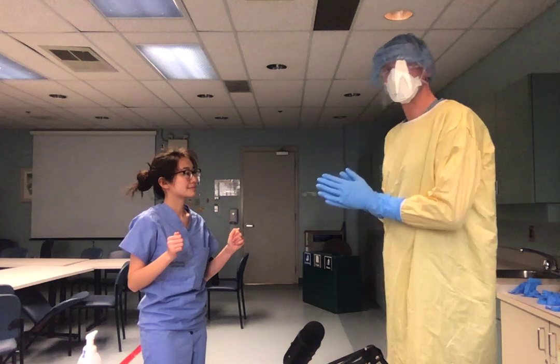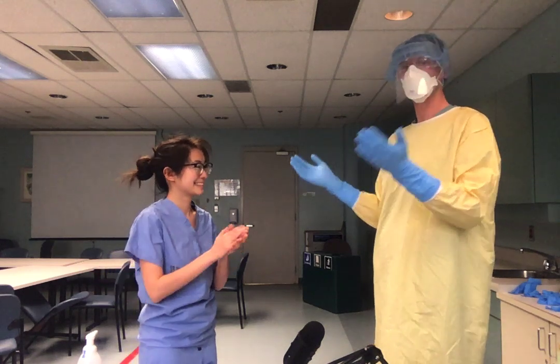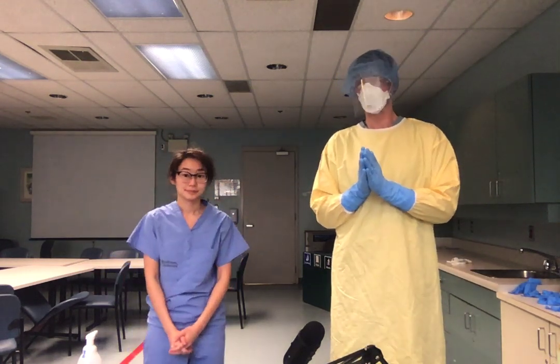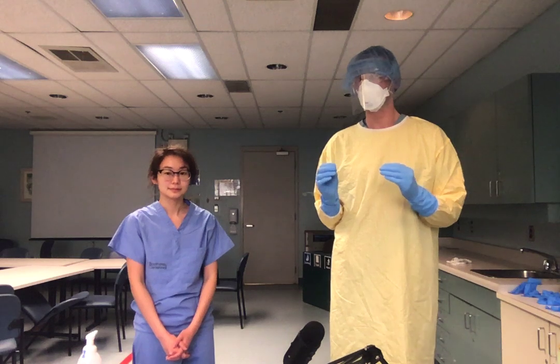Okay, so if she's in the hallway now, she's done. If she's in the anteroom, she's going to walk out of the anteroom and she'd wash her hands again in the hallway. Okay, guys, so that is doffing for you. Like I said, there's some variations by institution, but the principles are there, okay?